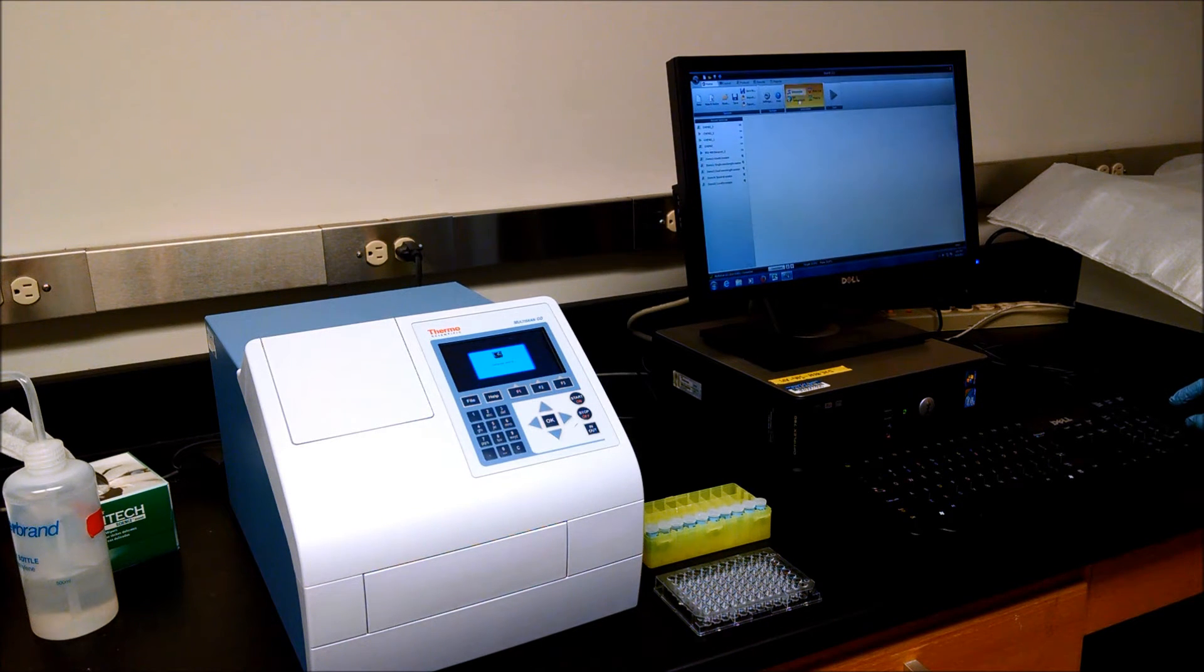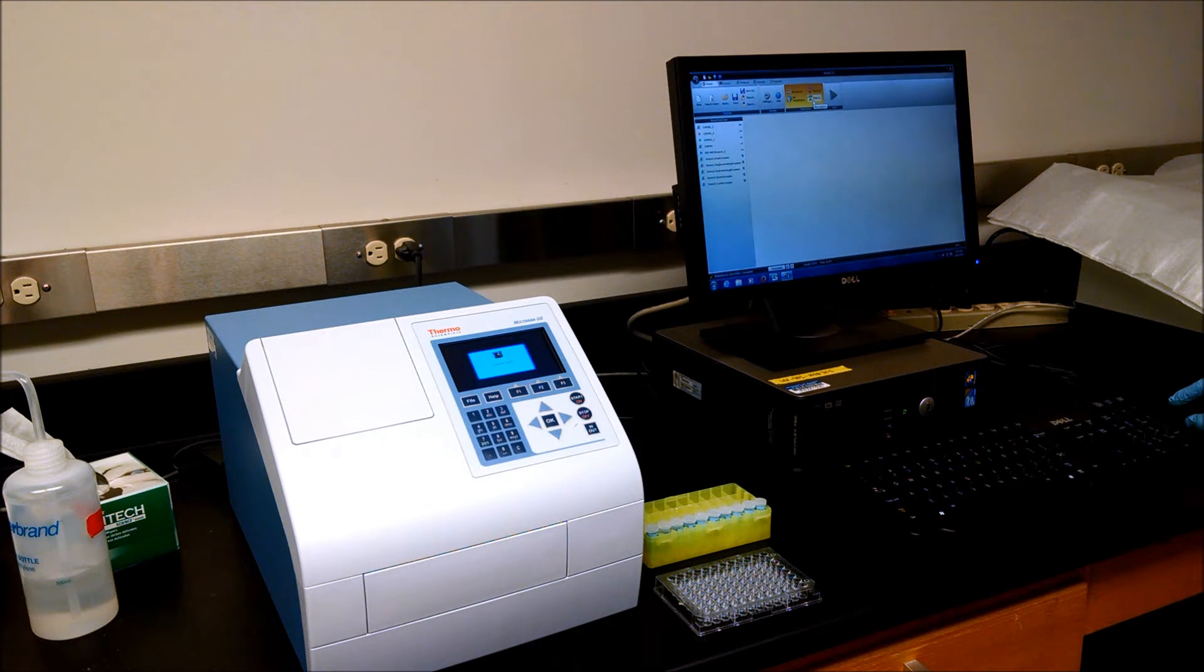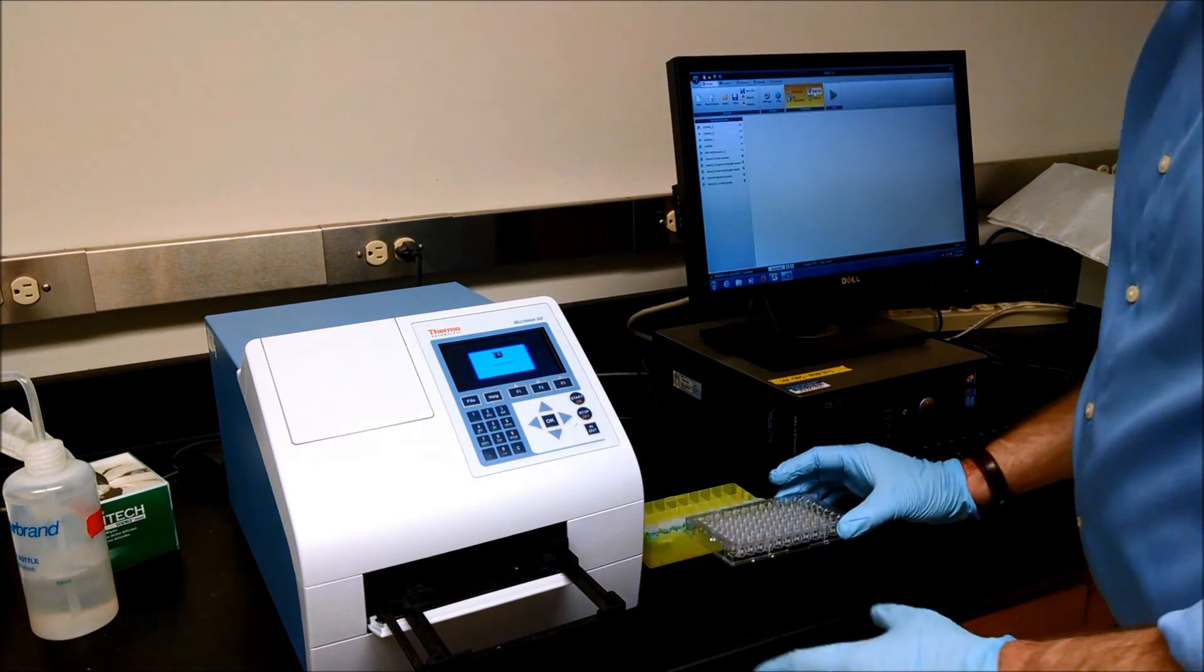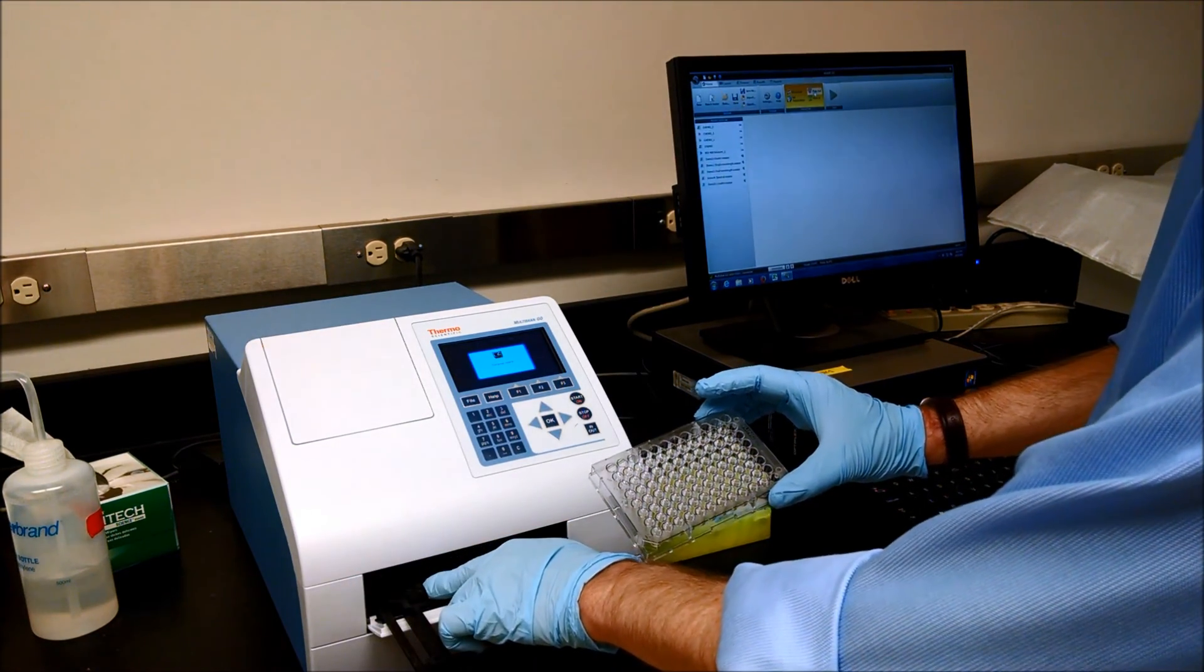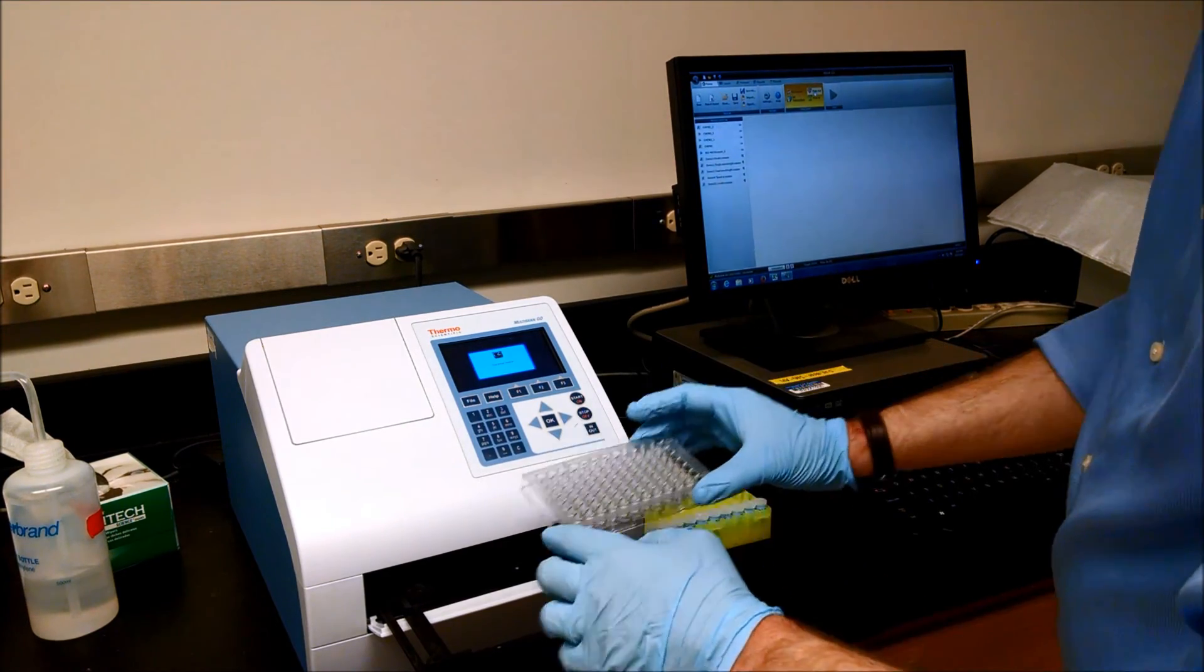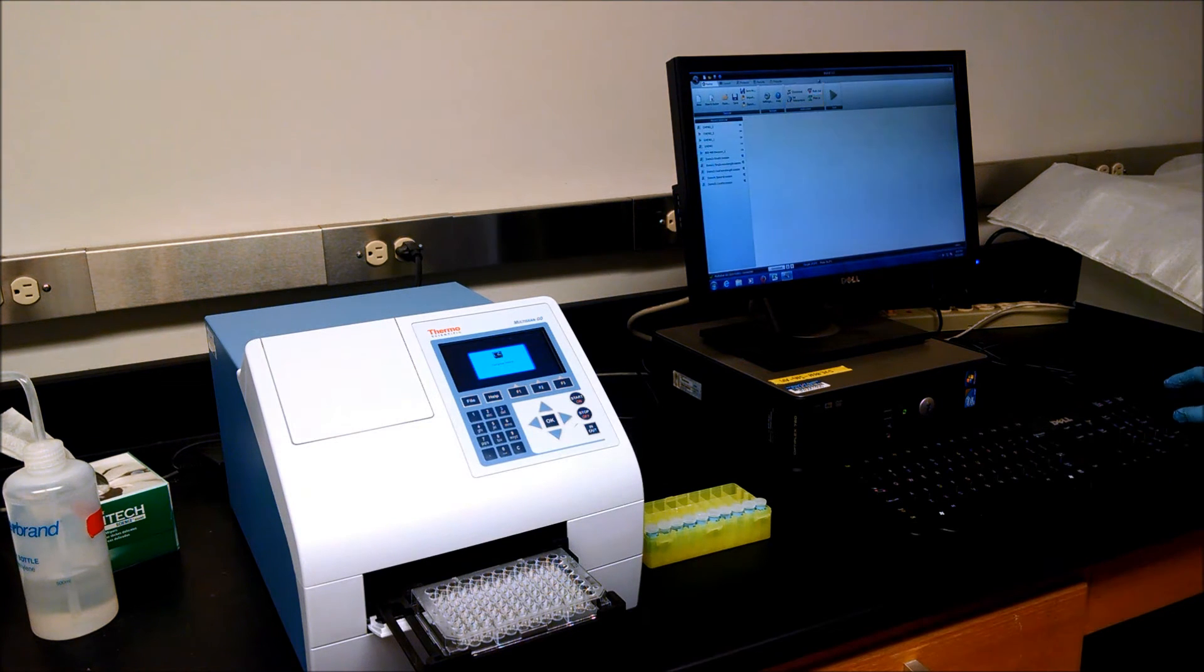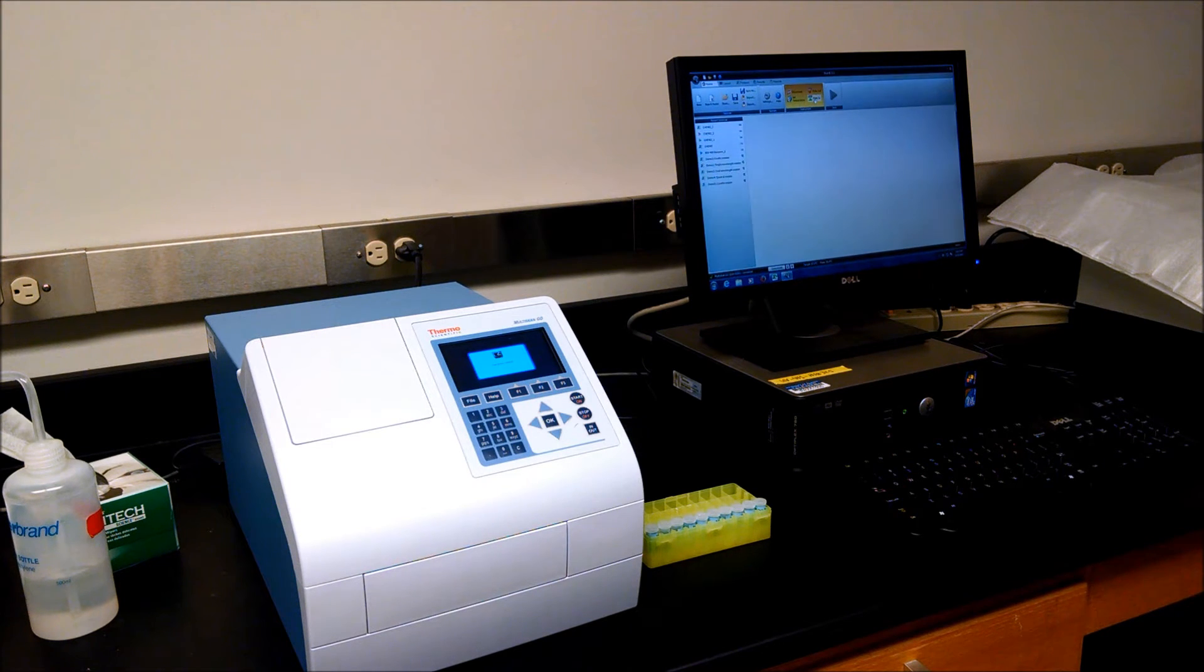We can set the temperature for the plate reader. We can make it do shaking or not. And we can also open the tray to put the plate in. Let's open the tray, and notice how there's a little mark here that says A1 in the tray. So you want to line up your A1 well with that corner of the tray holder, and then press plate in.